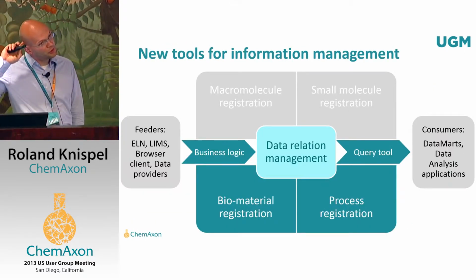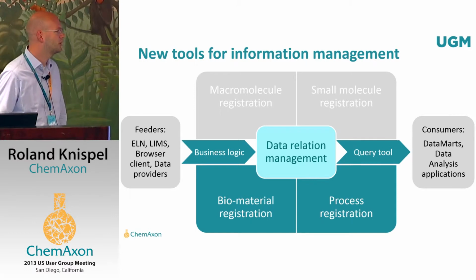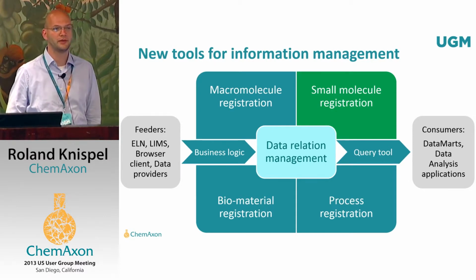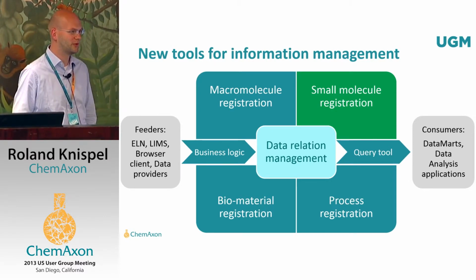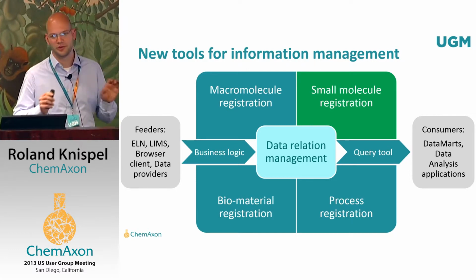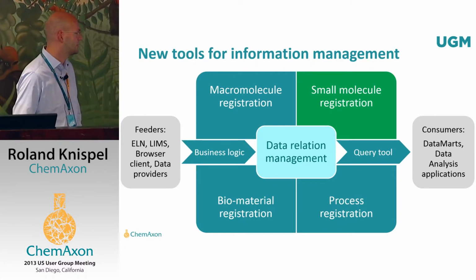But this is more like a future outlook of what we are aiming to develop. Let's go back to what we actually have developed so far. You've heard from Akos that we have a rather complex-looking small molecule registration system, but in fact it can be configured in a way that most of these things do not fall to any sort of staging area with manual intervention. So they can be set up so that it's in fact an automated small molecule compound registration system.